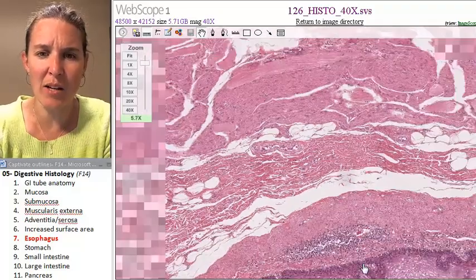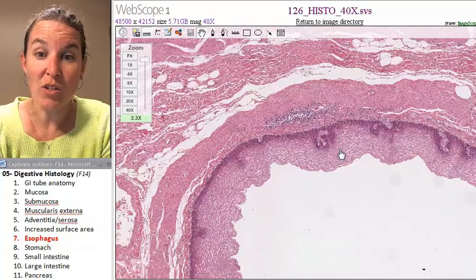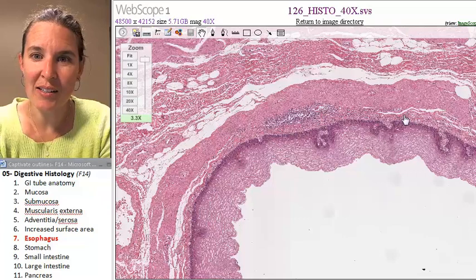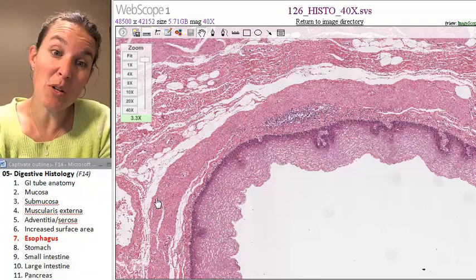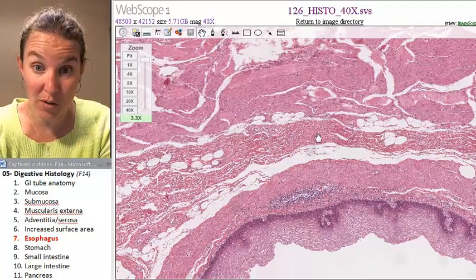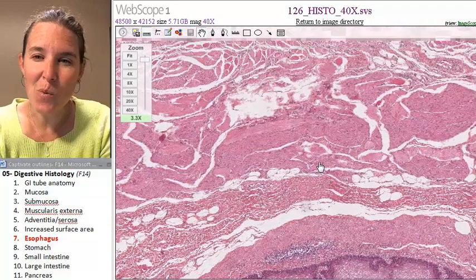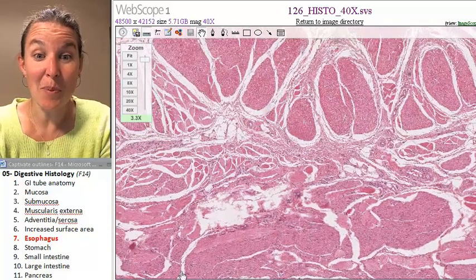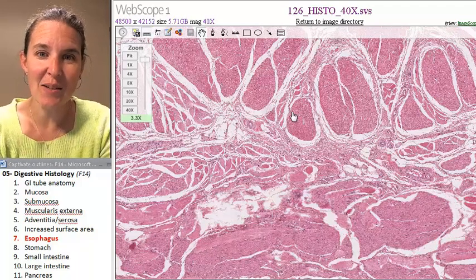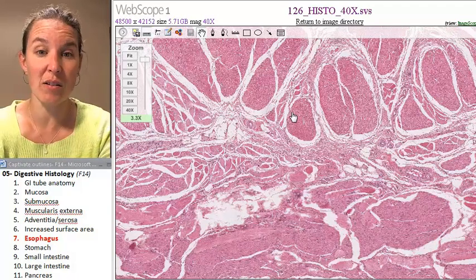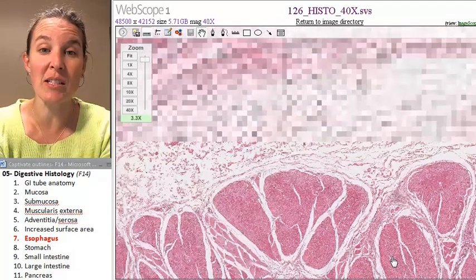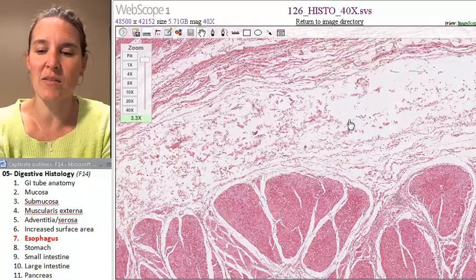I'm going to zoom out again to give you perspective of where we are. So: epithelial tissue, lamina propria just deep to that, muscularis mucosae in this case is pretty thick, and then we move into submucosa. Then we expect muscle tissue next — and this is muscularis externa. These big blobs of muscle are your muscle tissue right here.